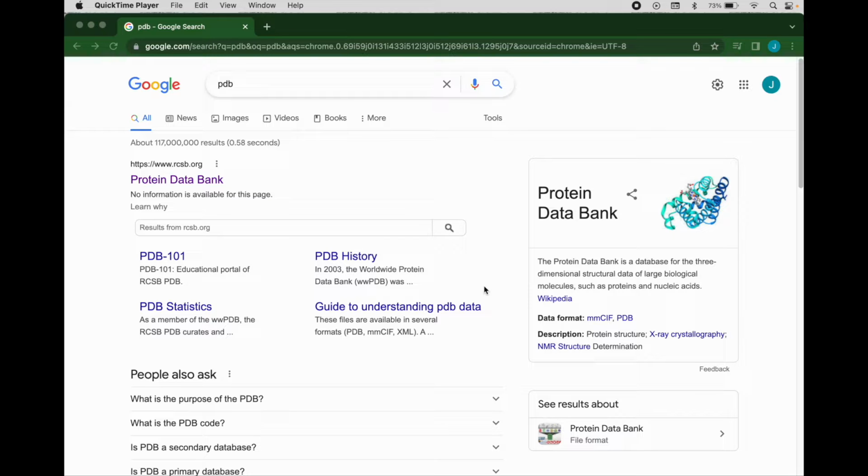If you haven't done molecular modeling yet, I strongly suggest you go and watch the part one and part two introductory molecular modeling videos on the Amino Labs YouTube channel. You'll definitely want to get up to speed on using the software because today we're just going to jump right in.